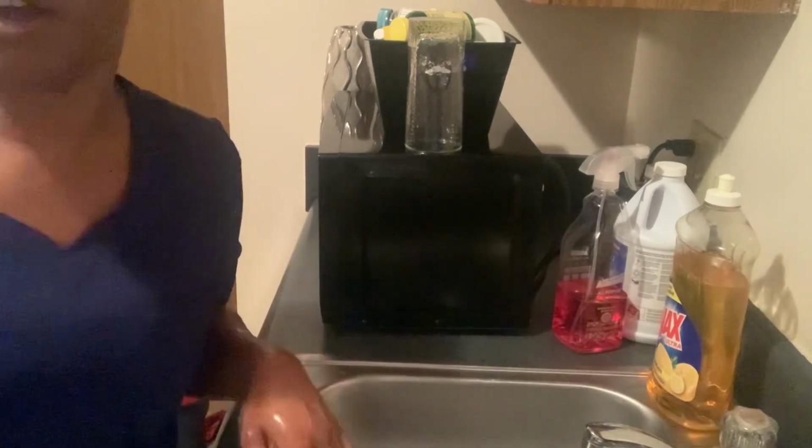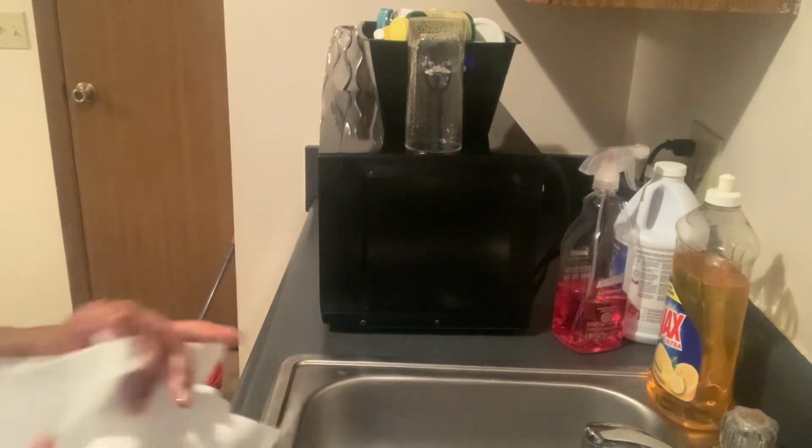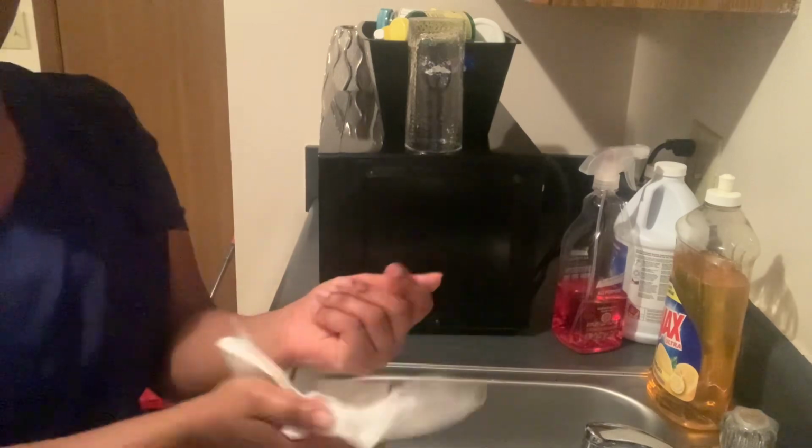Turn the faucet off, and then grab another paper towel, and then dry your hands off. Pat, pat, pat.